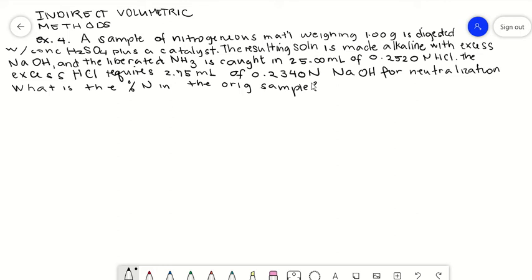Okay. So if you're going to determine percentage protein, for example, you're going to multiply the percentage nitrogen by 6.25. This is what they use in determining nitrogen, for example, in meat, or determination of protein in meat or dog food. That is one use. Okay.